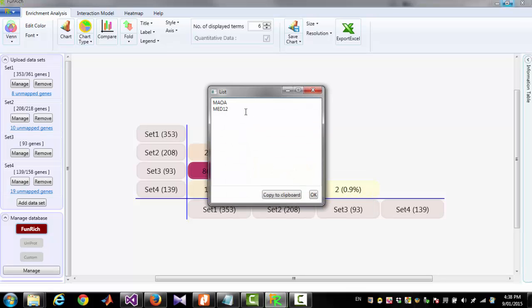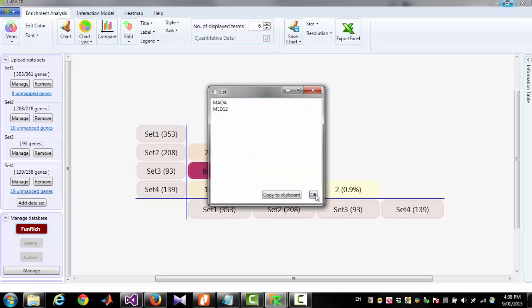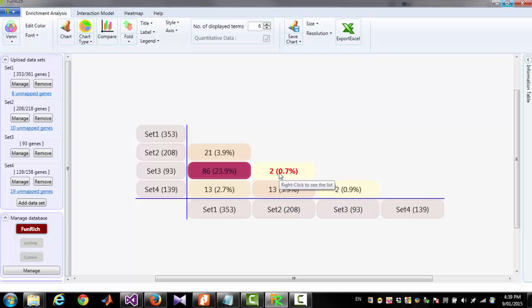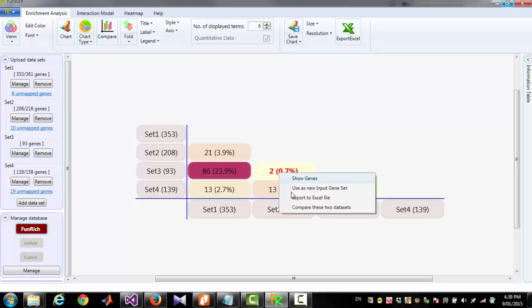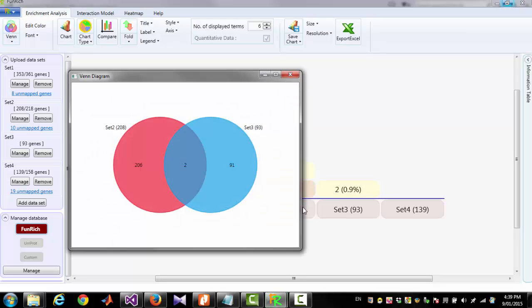You can see the list of genes. You can create a new dataset from those two genes. Or you can export them into an Excel file. You can also see the Venn diagram between Set3 and Set2 by clicking Compare these two datasets.